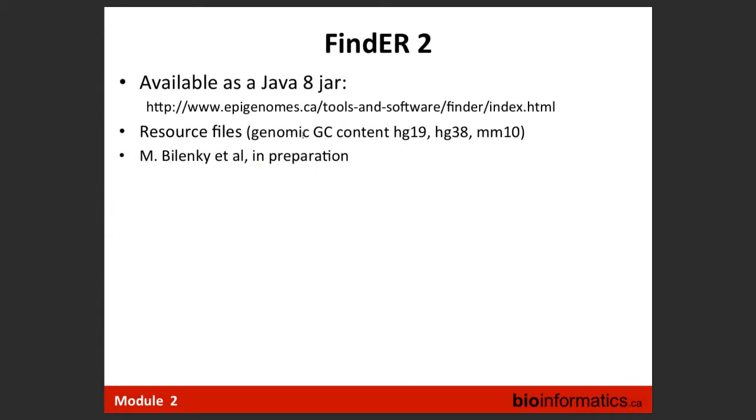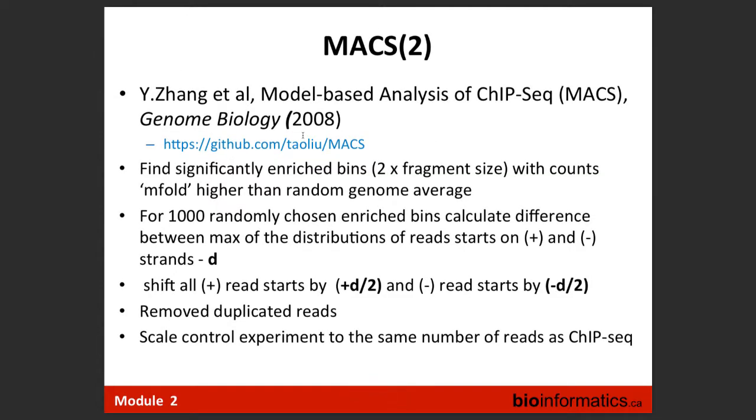That's available from this website, and you have it in your slides if you want to have a look. So now MACS2. MACS2 is the most successful tool in the business, and one of the reasons for its success is that it's one of the earliest tools, it's highly cited in the literature, and it's working. It's rather easy to install, and it will run. It is supported. Also, one has to be fair that if the data is of good quality and rather simple, it just works well.